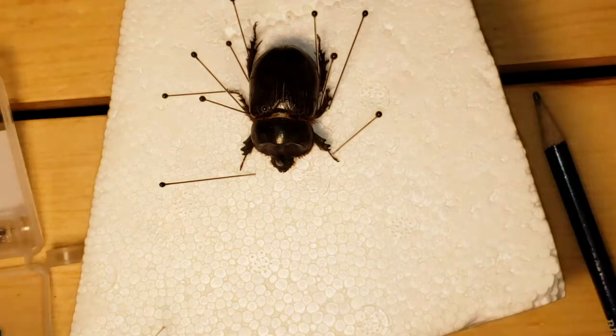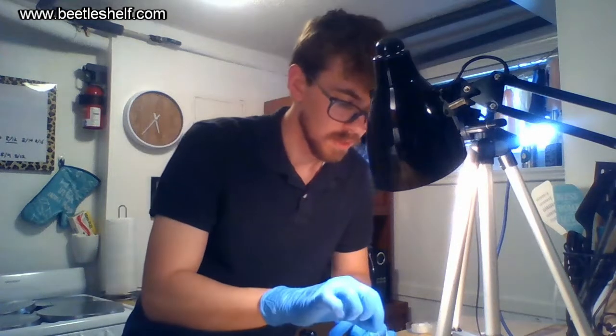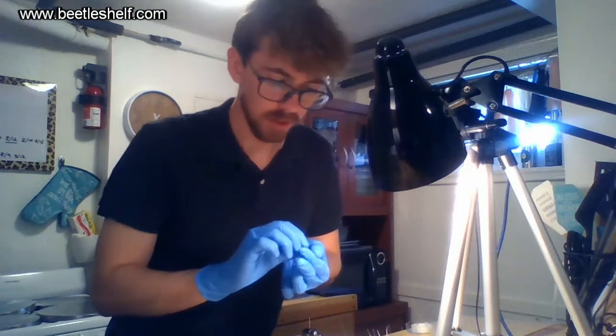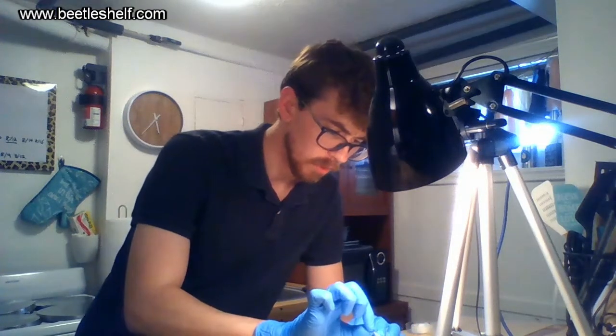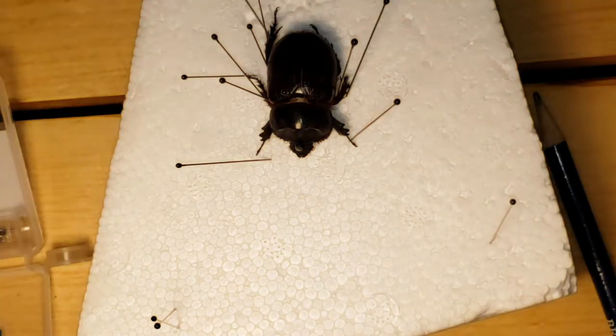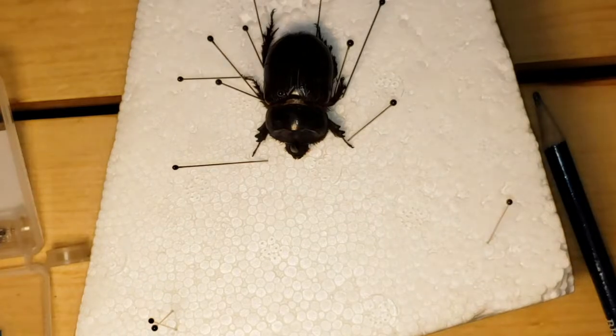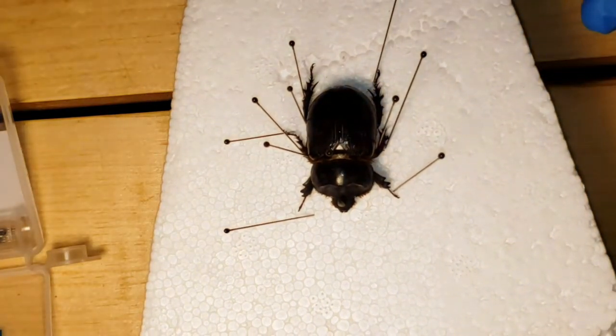I need to grab more pins. The pins I just purchased off Amazon — you can get them quite cheap; this is probably a set of about a hundred. Only one pin is ever really used permanently per insect, because you only have to put one pin through the insect itself.